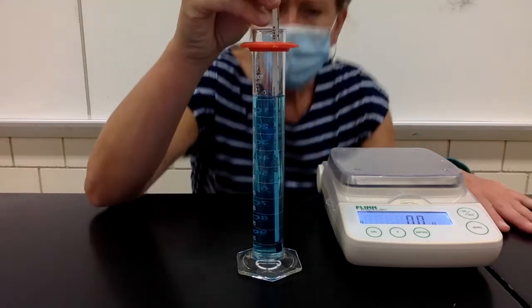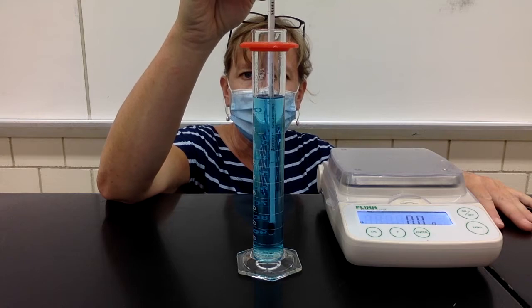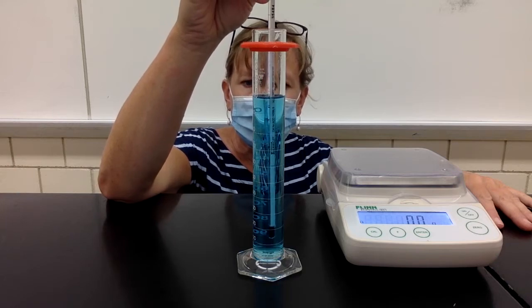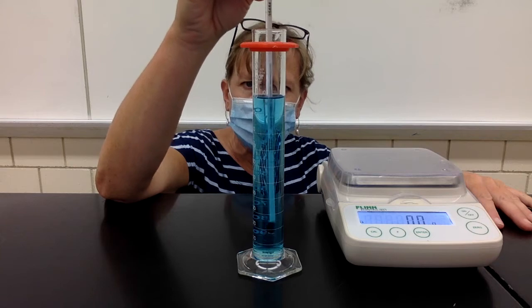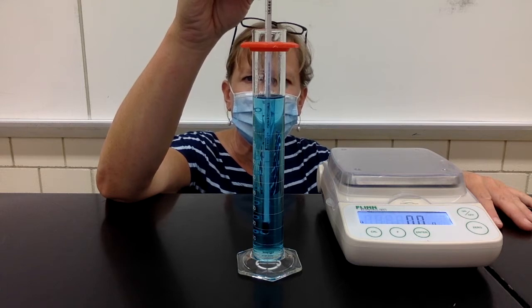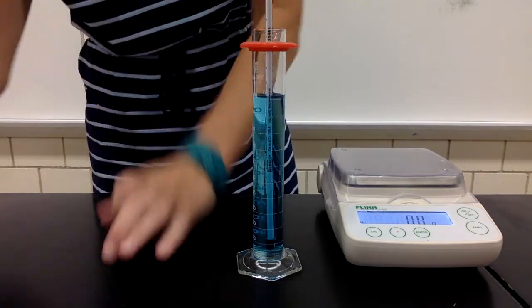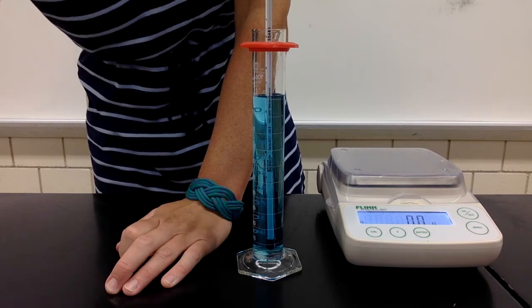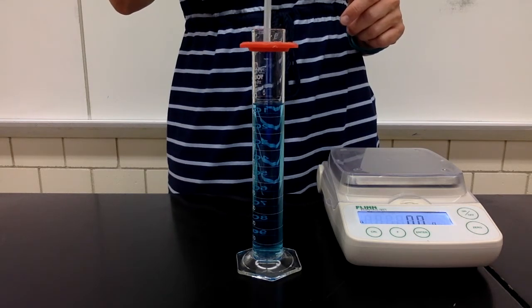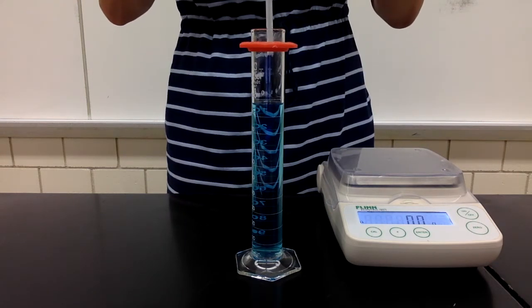So I'm going to start with temperature. Just lift it up a little bit so I can see it. I can still see lots of bubbles rising up to the surface from the bottom, fewer bubbles at the bottom and lots of bubbles at the top. It looks like the temperature has gone up to about 32.1, just over the 32 mark. So I'm going to try to get as much of this liquid off here as I can.